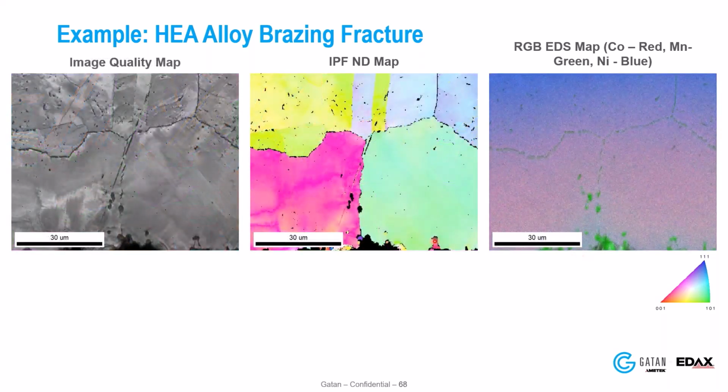And then this was fractured, and we're looking here. At the bottom part, you can start to see where the fracture surface is present. This is the image quality map. With the image quality map, we see changes in the image quality that are just small changes in rotation. It's pretty remarkable that depending on which bands are detected and how they subtly move in orientation, more or less caught in the area of interest, we can see some pretty strong deformation diffraction contrast within this grain in particular.